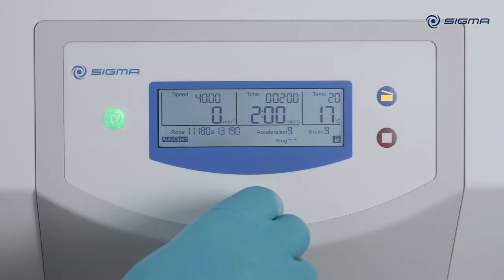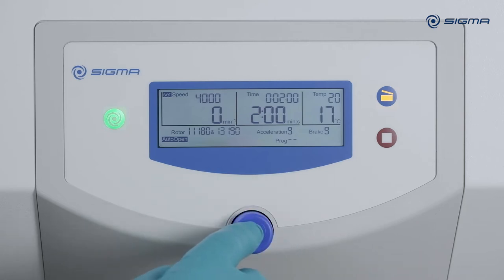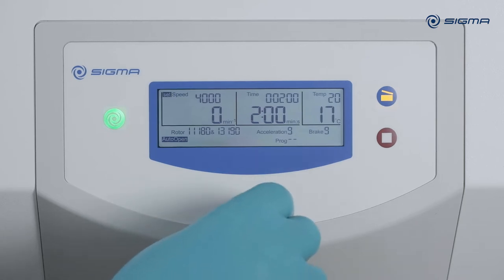To set the speed, turn the knob one click to the right. After pressing the knob, you can select a different value and confirm it by pressing the knob again.